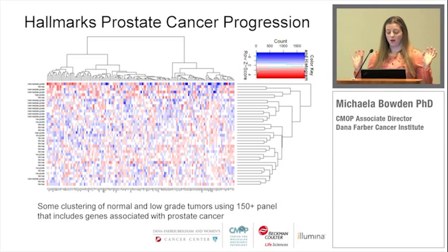And just without mining the data, by just pulling these 150 genes out, we're able to get reasonably good separation of our normal and low-grade tumors from our high-grade tumors, which, without doing much filtering of the data or anything, is actually a very promising result.